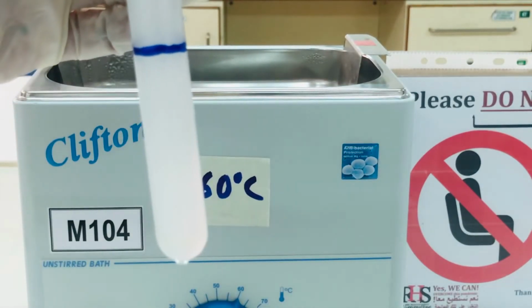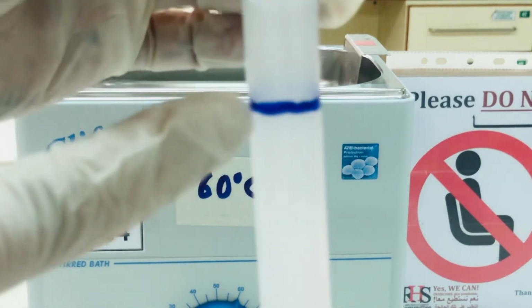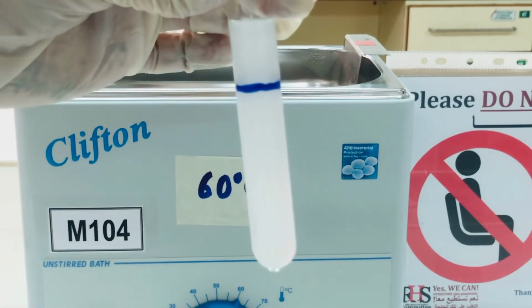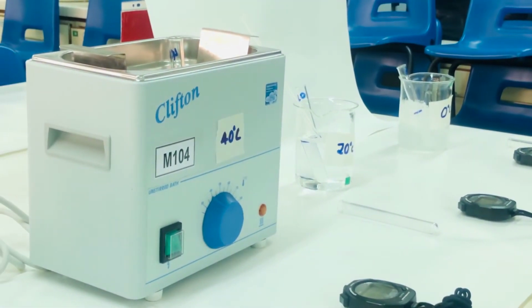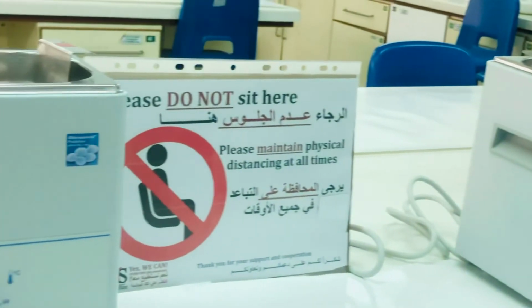We have to record the time taken to become transparent. And now I will put this sample back in the water bath. As you can see, all the milk samples have been mixed with trypsin and the time is being recorded.